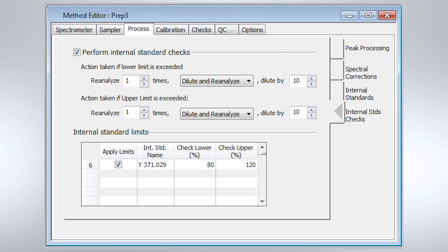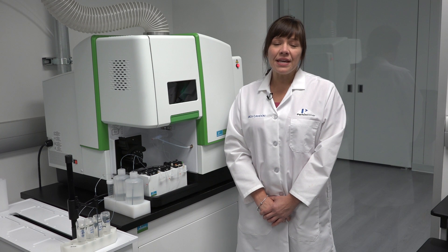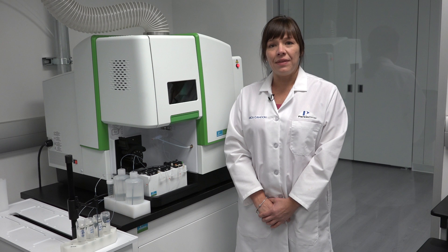In a similar manner, you can set up the specified limits for your internal standard recoveries. Now, if the internal standard recovery falls outside of that specified criteria, the PrEP3 will dilute by the factor set and reanalyze. You can see how valuable the PrEP3 would be in any lab setting by providing automatic calibration and the elimination of manual dilution.